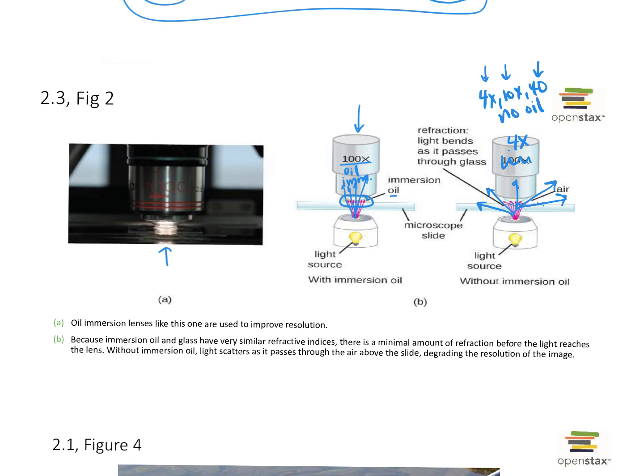So it doesn't normally, again, hurt it to have oil on it, but you don't want to get the oil actually in the lens. Okay, so it's fine to go back and forth from the low power to the oil immersion one, but you don't want to drag that 40x one through the oil.